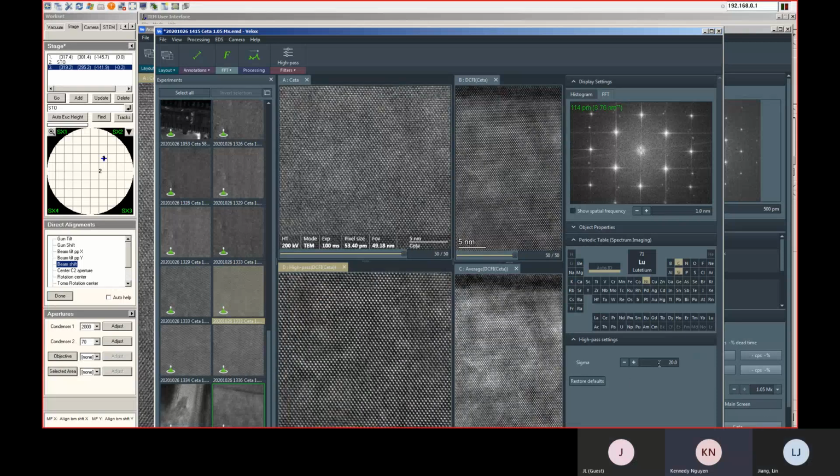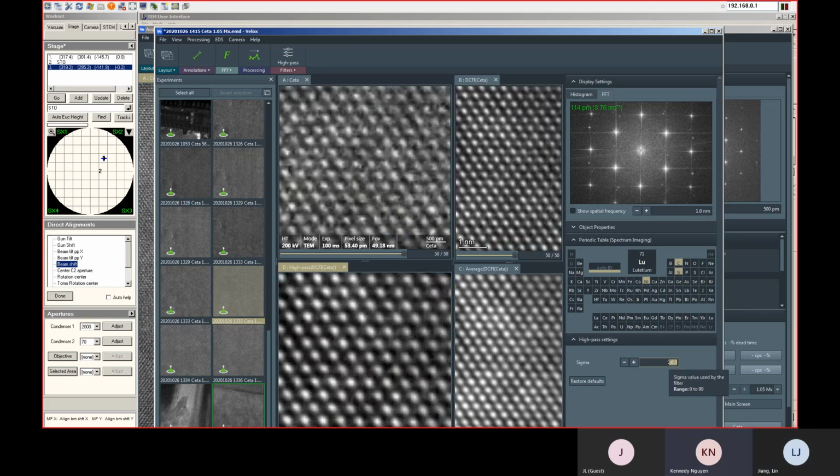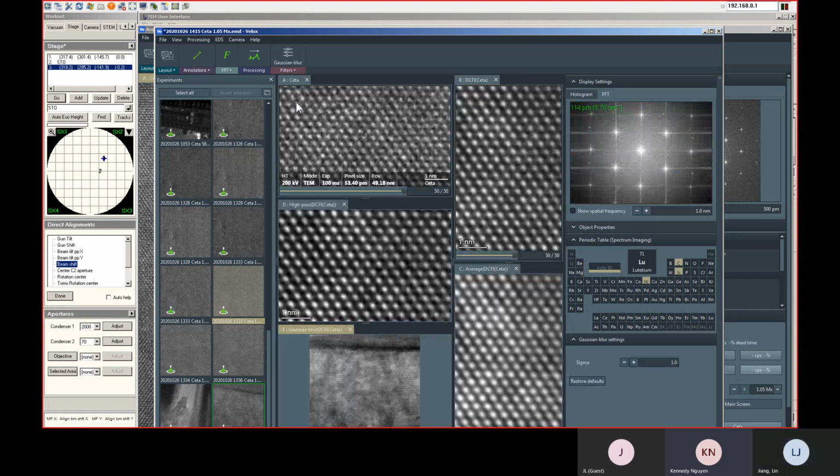And then is this the sigma settings for changing the roughness? Yes, it's basically default is 20. The larger number means more filtering. Okay. And then is it an update as you go? Yeah. Or you can update. Okay. And then you can try different filtering. You can try, what is this, the Gaussian blur, I guess?